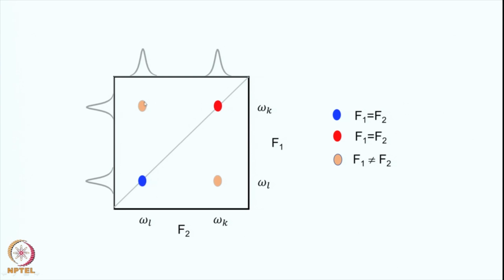This will depend upon the interactions between these two spins, whatever the interactions are, and that will be reflected in the 2-dimensional plane. And this was a phenomenal effect, because where there are lots of signals present underneath at one particular place, you could filter out those signals which are interacting. Okay. So you can figure out from the cross peaks which spins in this spectrum are interacting.